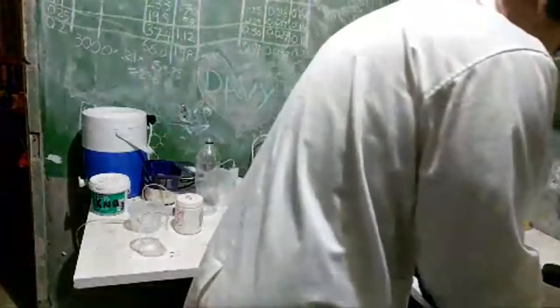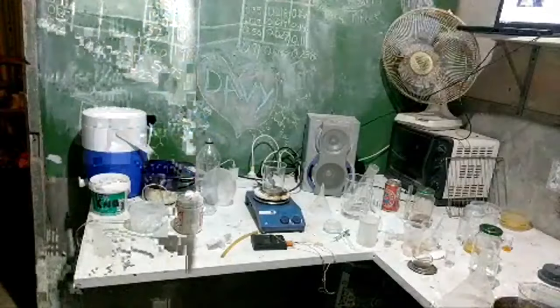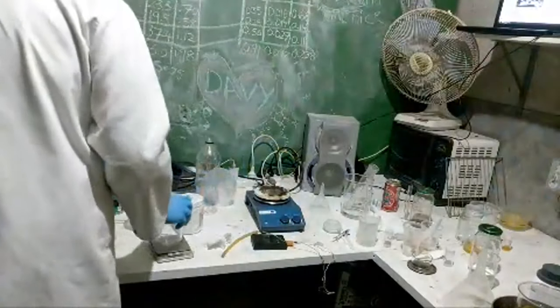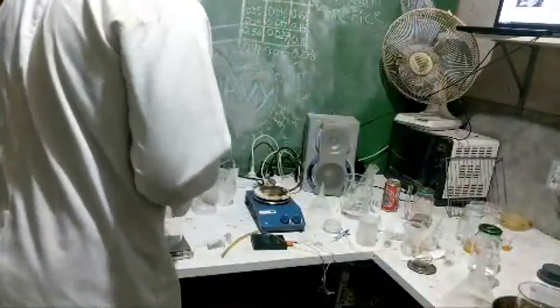We're going to follow Matt Hunter's advice here on the chat, which is add iron hydroxide to the concentrate thing. We should measure the iron hydroxide amount because otherwise I can't determine how bad my yields are afterwards. What the fuck are you doing? You should try it small scale first.